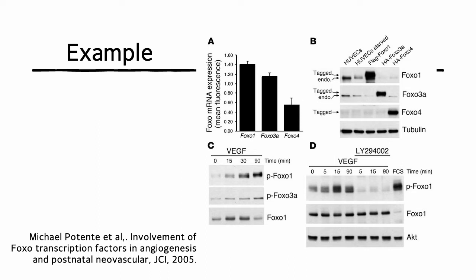This mRNA expression can be compared with PCR. Then they compared the amount of protein of FOXO with Western blot here.